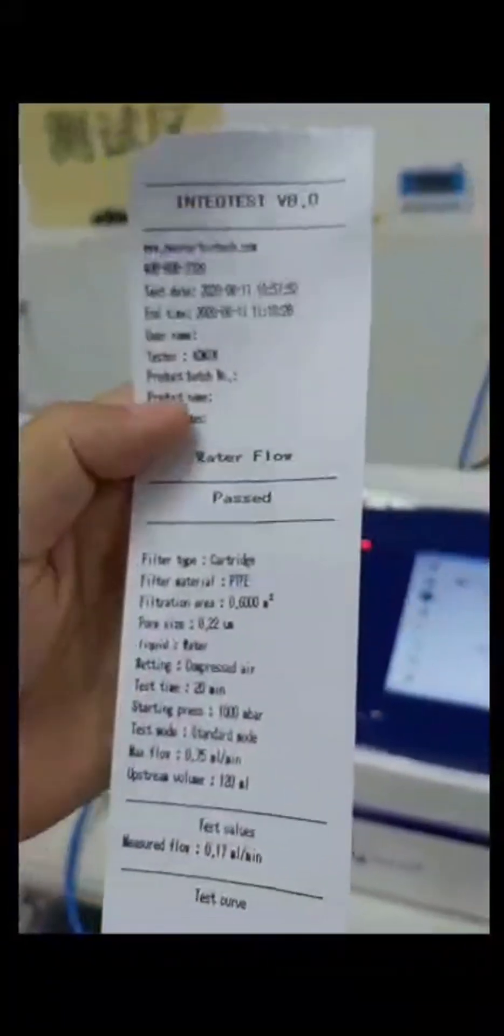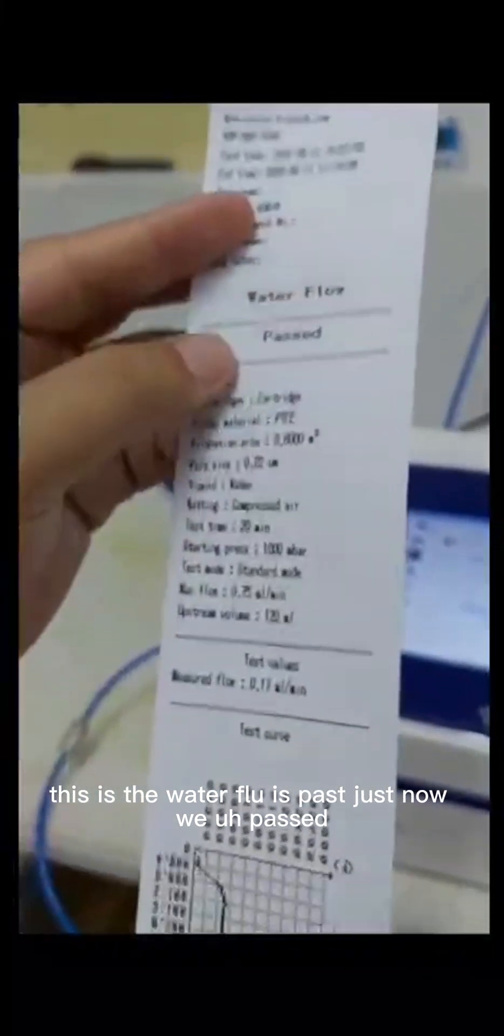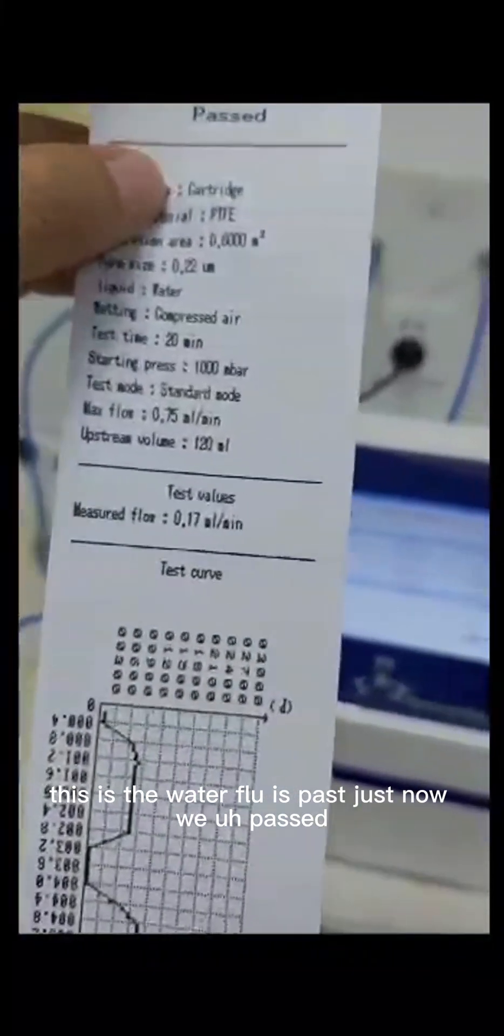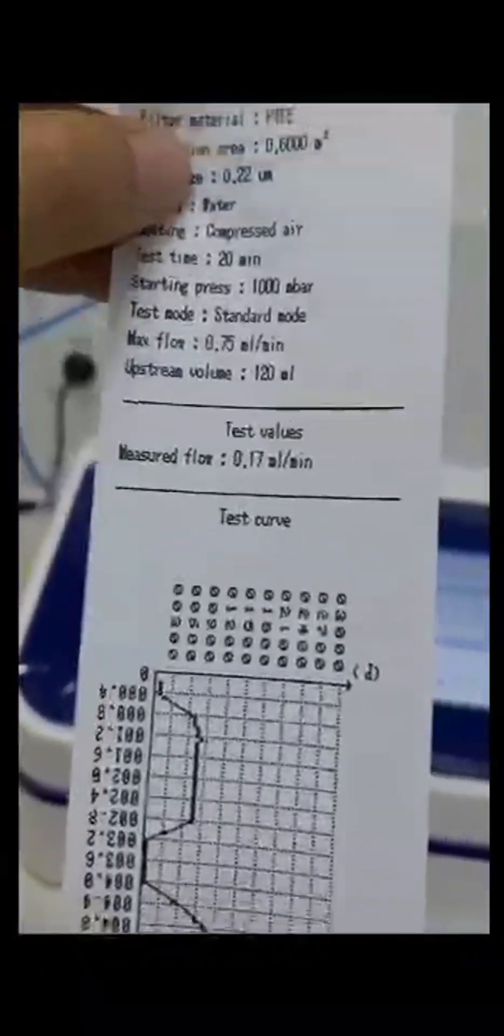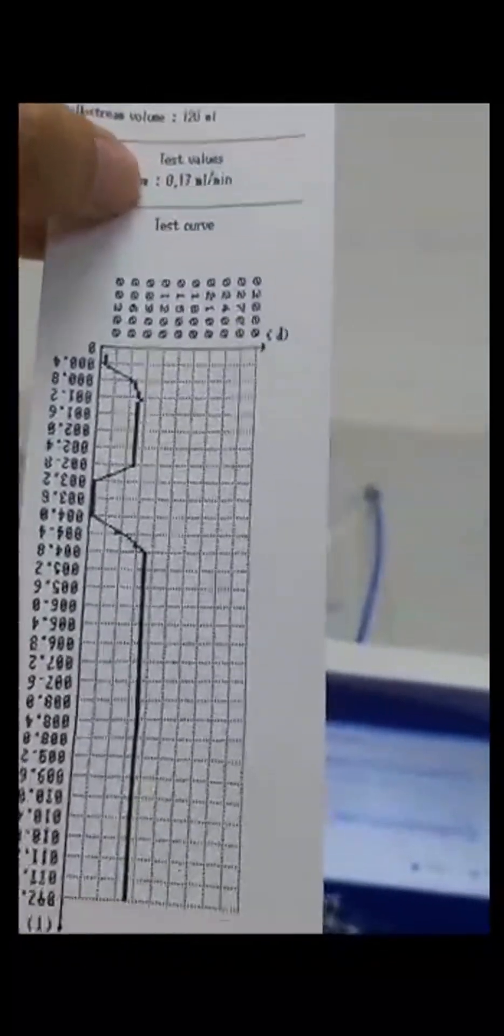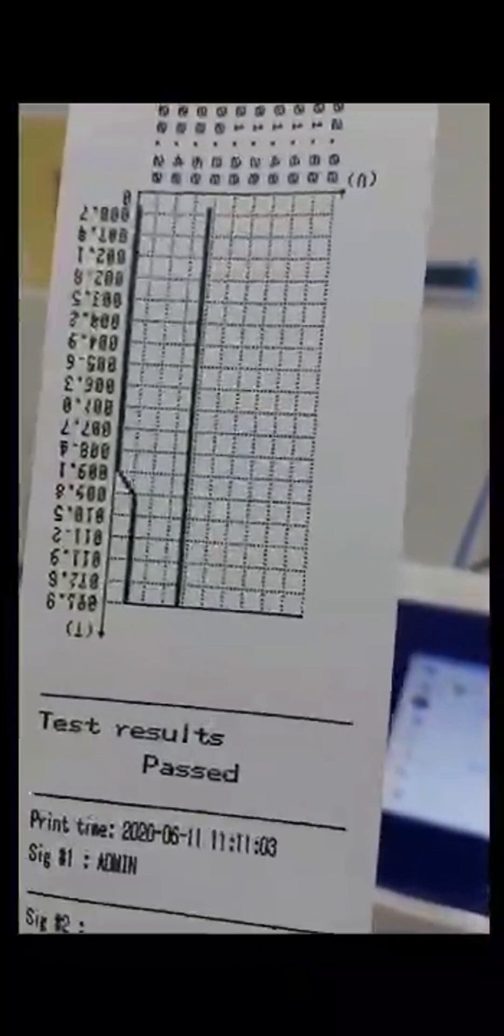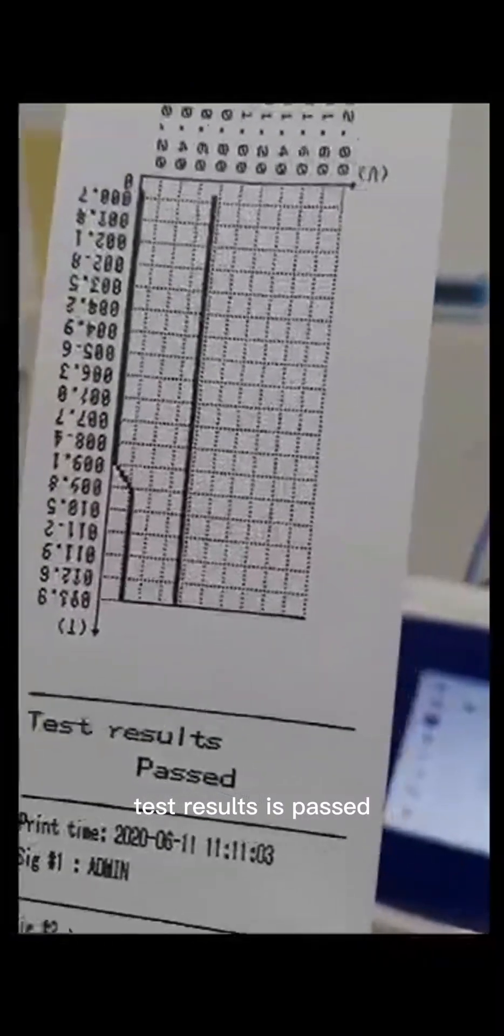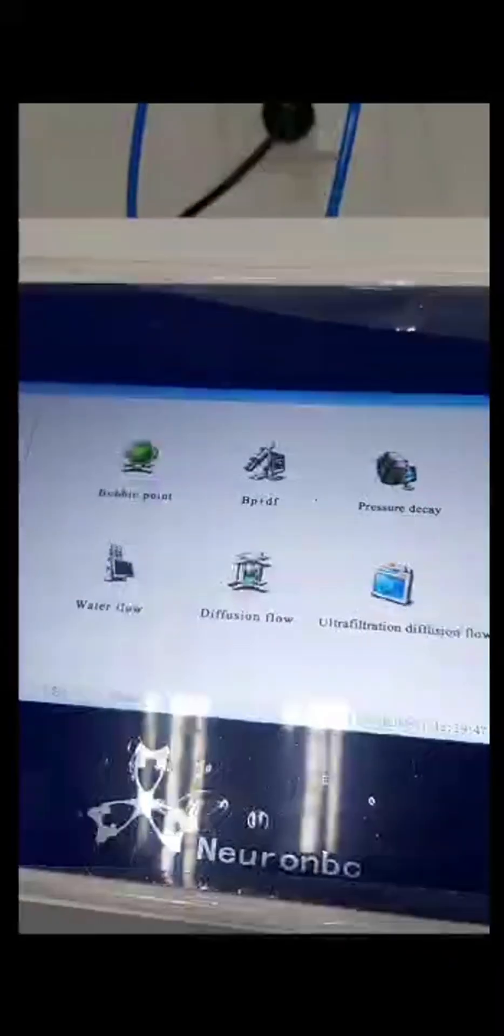You can see the print test. This is the water flow. It's passed. Just now we passed. You can see. The test is passed. Test results is passed.